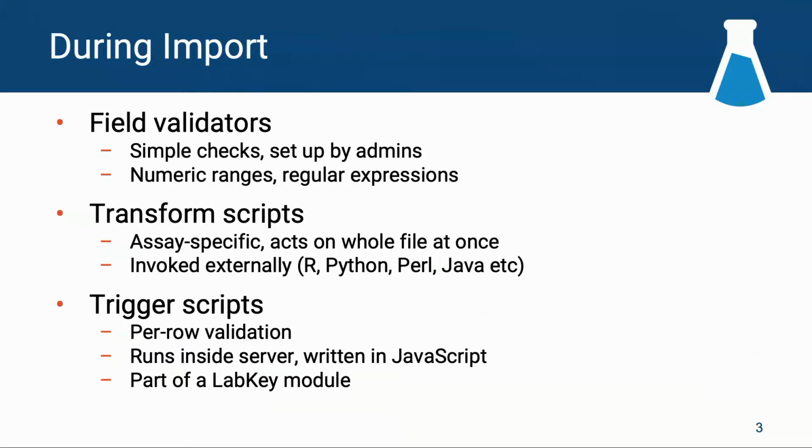I guess who's done any of these approaches so far? Has anyone written the code? Avital, very good. How'd it go for you? Perfect.